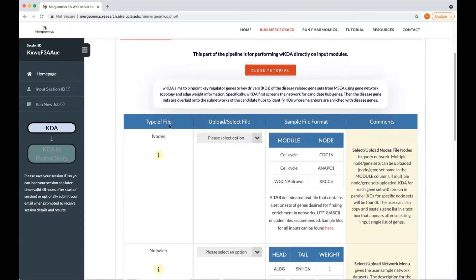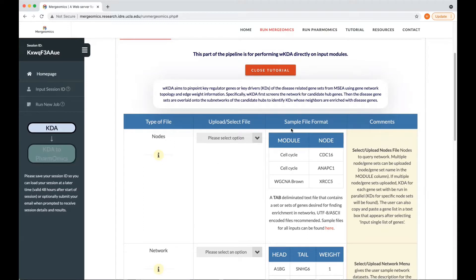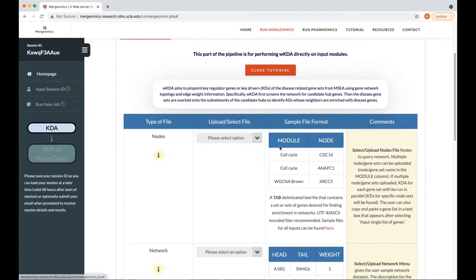The first file that you can upload or select is your notes file. If you are going to upload your own notes file, you must ensure to follow the sample file format where you will have two columns with the headers module and node, which must be capitalized.